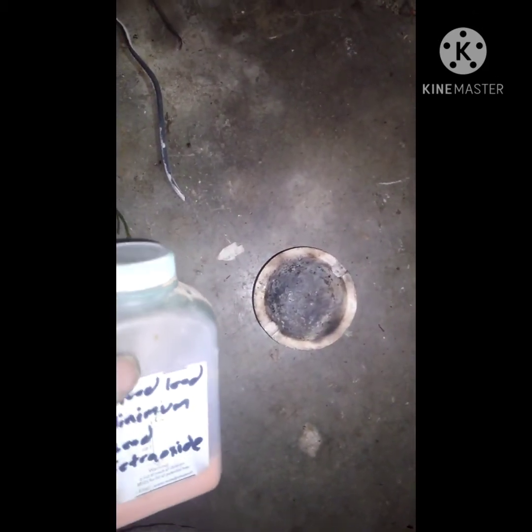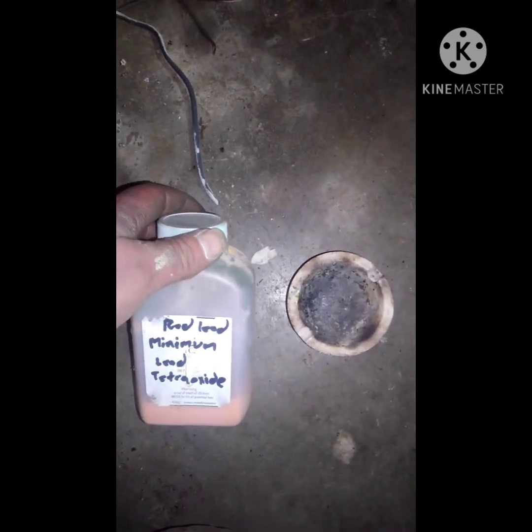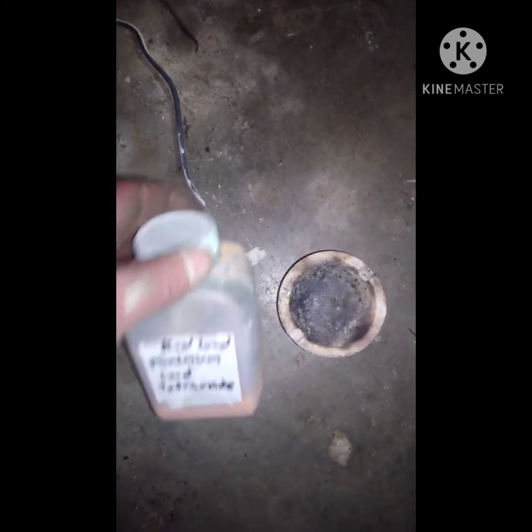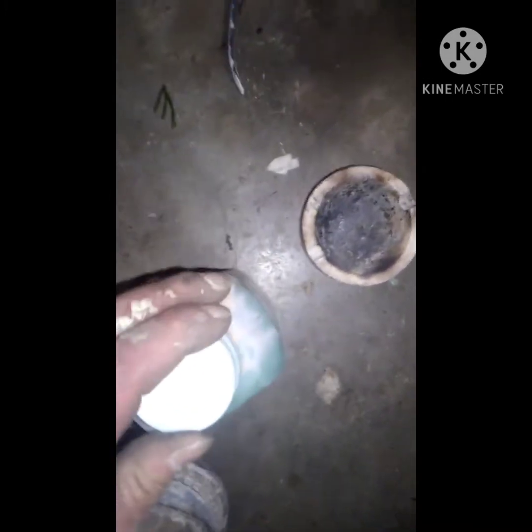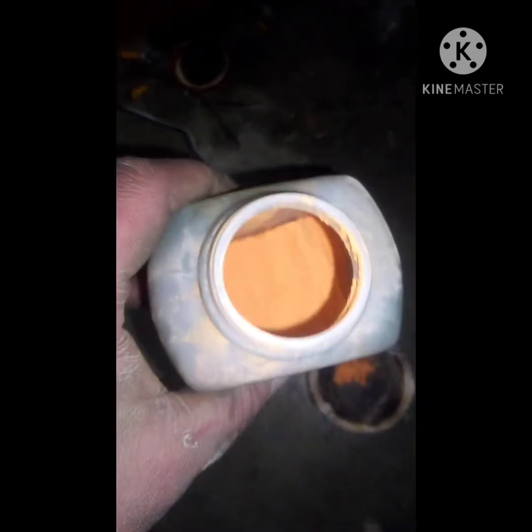Alright, so this video is for one of my watchers. Here's some red lead, or lead tetroxide, that I made. Let me get this thing open. All I'm going to do is burn it so you can see what happens when it gets burned with a torch. You can see the color of it — it's like a neon orange color. The camera doesn't really do justice for how orange it is.